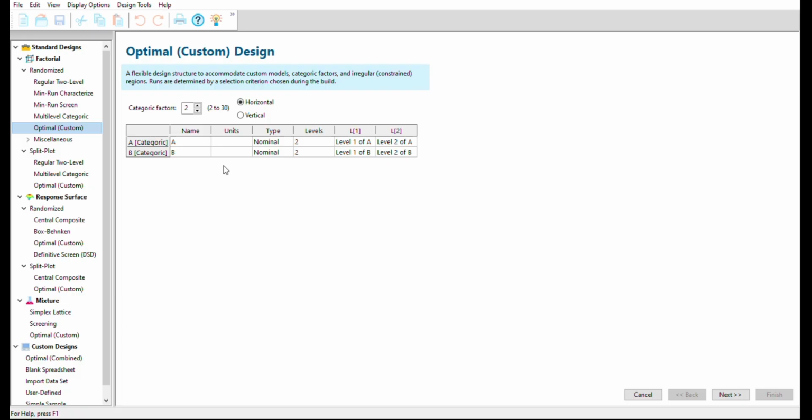We have a lot of things that could be kept as a factor. Our drying rate, mixing rate, coating rate, spray pattern, percent of excipient, binder, or disintegrant could be a factor. A lot of things could be your factor, depending on your choice of the design and your consideration of the factors.